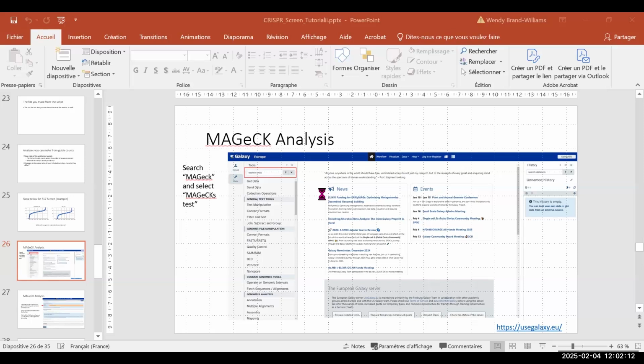So for example, you can look at the second sequence down, the ZZZ3, and you can see in the uninfected ones, it's fairly well represented. You've got 500 for the library, plasmid library, about 1,500 for the uninfected A10, and 800 for the other one. And essentially what we'd be looking for is any major skewing in the low versus the mid and the high. So in this one, it's not really seeing much going on. There's about 386 in the low. If it was a hit, that number would be in the thousands, and you would see much lower numbers in the mid, the high level. Okay.